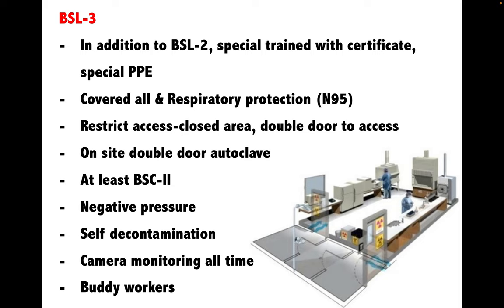BSL 3, in addition to BSL 2, requires that people working in BSL 3 be fully licensed with specialized PPE such as a Tyvek lab coat and N95 mask. Very strict access is required through double doors, and a double-door autoclave must be available on site. BSL 3 must operate under negative pressure air ventilation with self-decontamination. A monitoring camera must be on at all times, and you must always work with a partner — you cannot work alone. There should be a BSL 3 venue at CMU soon; there are very few in Thailand.